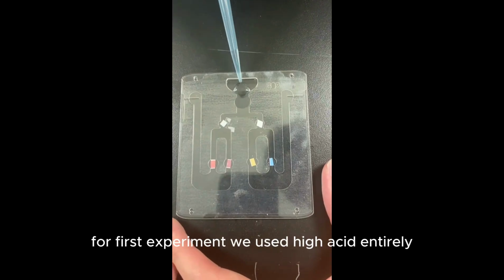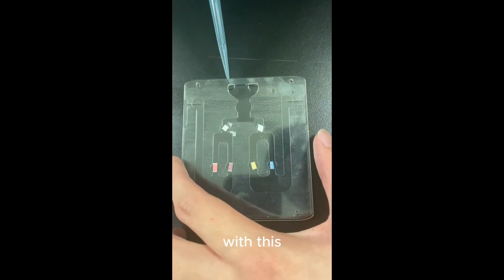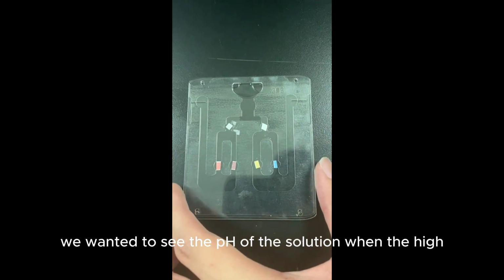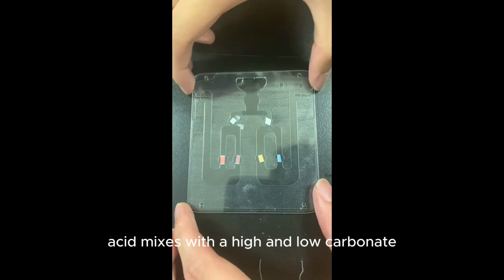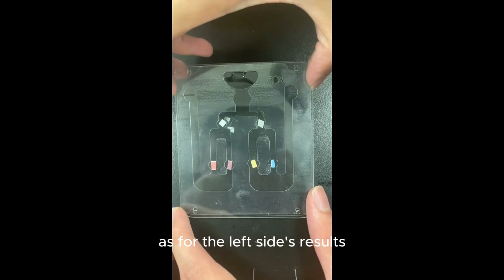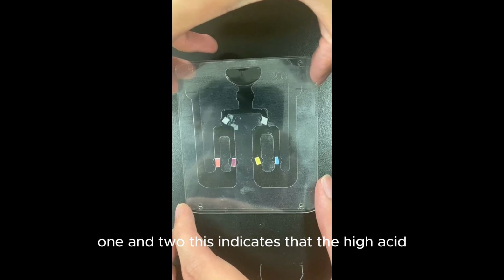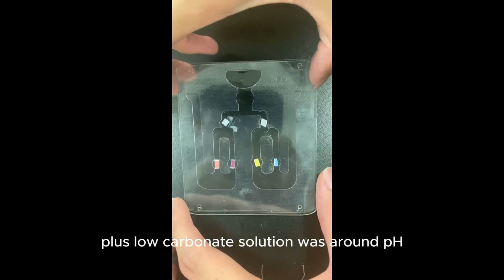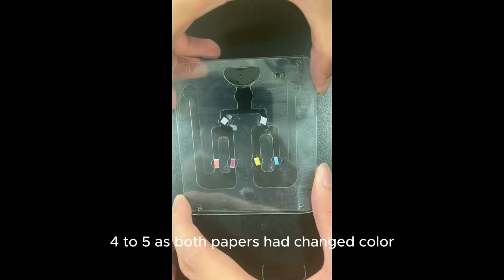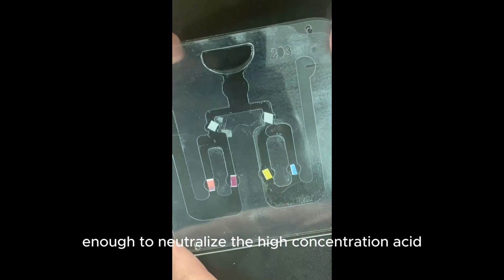For our first experiment, we used high acid entirely and had a low carbonate on the left and a high carbonate on the right. With this, we wanted to see the pH of the solution when a high acid mixes with a high and low carbonate. On the left, we have pH paper 1 and pH paper 2. As for the left side's results, the color change was present in both pH papers 1 and 2. This indicates that the high acid plus low carbonate solution was around pH 4 to 5, as both papers had changed color. We know that the low concentration carbonate was not strong enough to neutralize the high concentration acid.